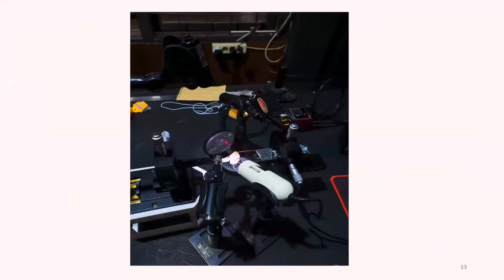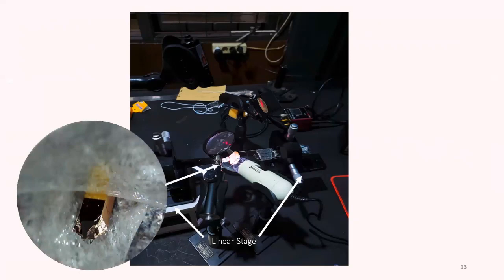Here is our experiment setup. First, we have our linear stage. It basically moves our cantilever and our sample in 3 different axes by turning the knob on the stage. Zoom in. We have our cantilever.